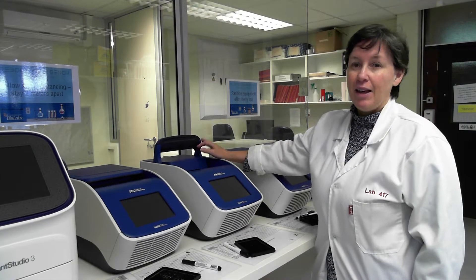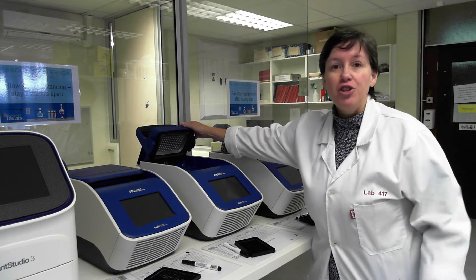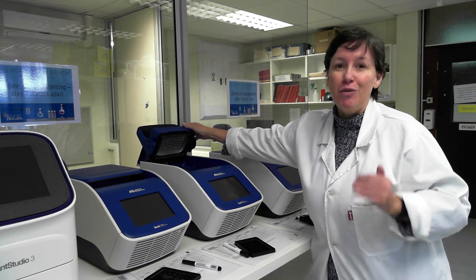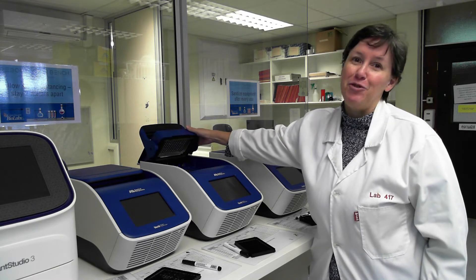So over here, we do the DNA extraction through cells. We've got all the equipment that's needed to do that, as well as doing PCR reactions and qPCR. This is a PCR machine — we've got four of them here. This machine is used to make multiple copies of a specific piece of DNA, almost like a photocopier, except for DNA molecules.